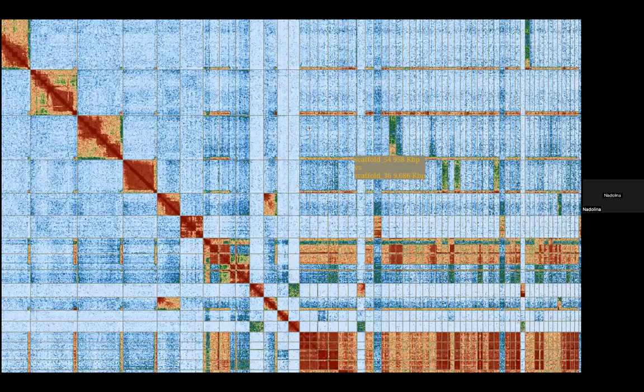And so what that typically ends up being is repeats. And repeats are, like I said, pretty difficult to resolve because they often interact at several points along the assembly. But you can do your best, right? So there's some obvious pieces here. It also could just be smaller pieces that for whatever reason didn't get assembled, but are very capable of assembling.